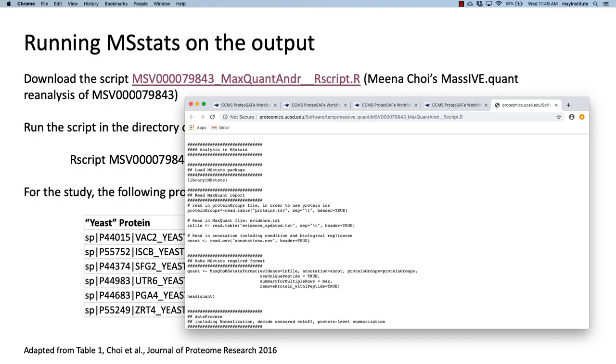All right, for everyone else, it's cranking through the numbers. Let's let it run for a little bit, five minutes, and we'll see what we get there. Let's give it a couple more minutes. Then we'll see how to create an RMSV for sharing results. Anyone for whom the analysis has finished?